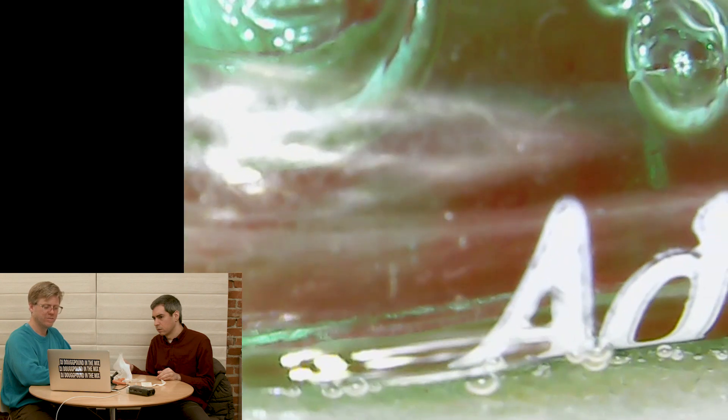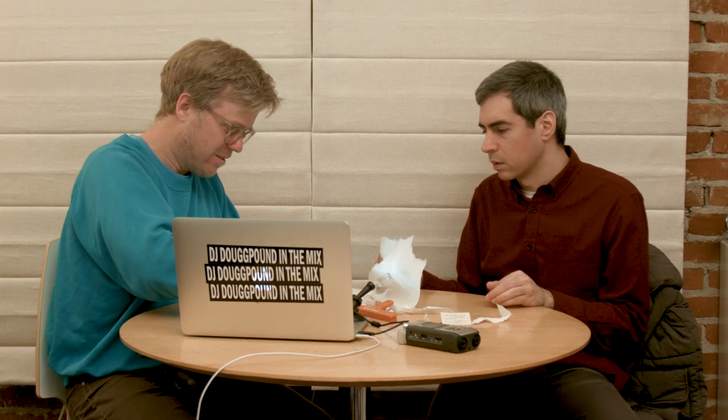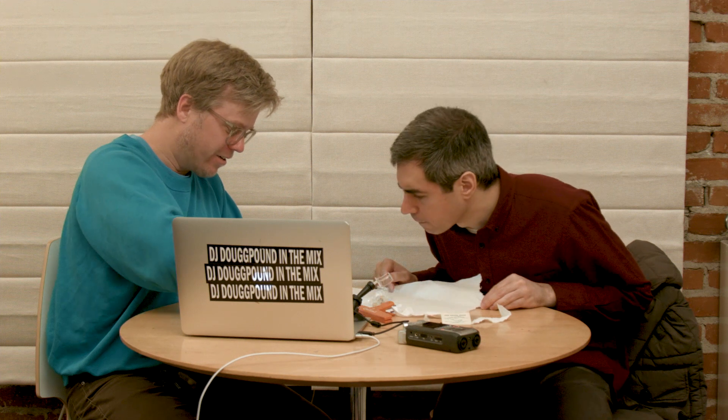And the gel, they just make it look green, like that's some kind of... Maybe they tested it and like a green pill seems like it's healthy. The green pill, isn't that supposed to turn you on or something? But look at that. I mean, the actual juice, the medicine, is clear. It's fully clear, isn't it? It's clear.